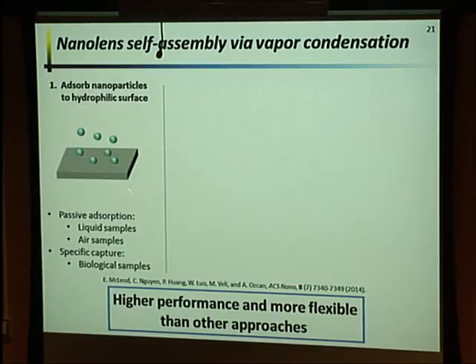We take the particles we want to detect. We somehow attach them to a hydrophilic surface. And this can either be done passively, in which case you just kind of dump everything from your sample onto the surface, or you can have specific capture. And I'll show this maybe 10, 15 minutes later, how we can do this with specific capture.